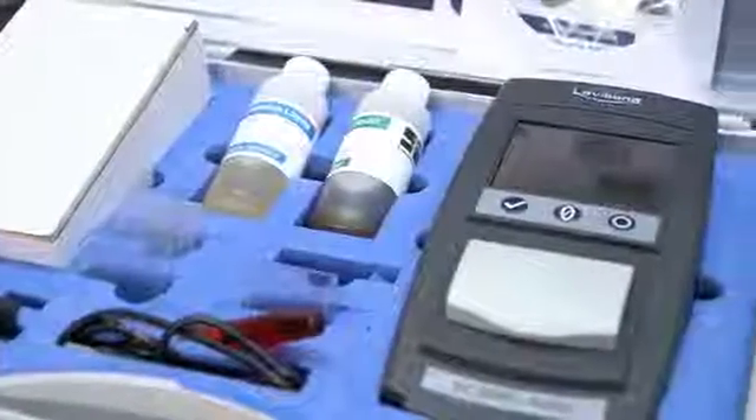Hello, I'm Matthew Russell from the Tintometer Group. I'm here at PEVTEC 2015 to present some of our new products, in particular the eComparator. The eComparator is a new portable instrument we've developed — 'e' as in electronic comparator.